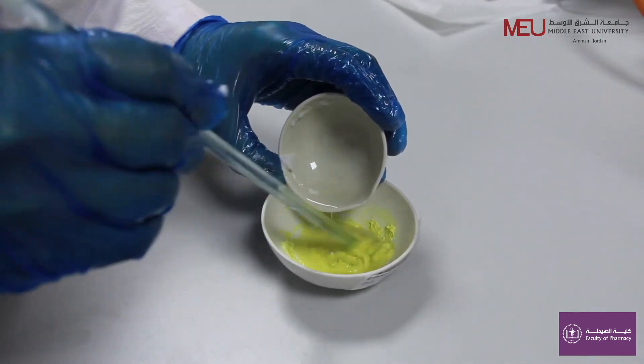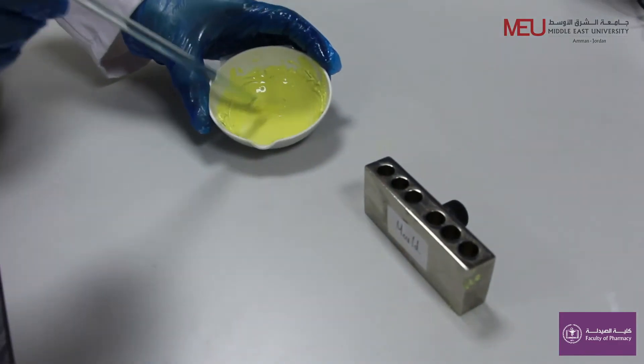Add theobroma oil paste to powder. Mix until homogeneous.